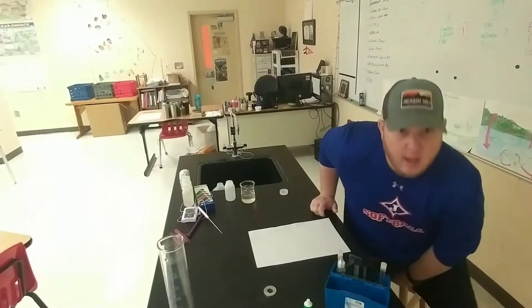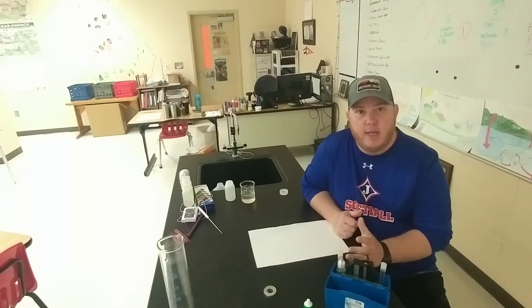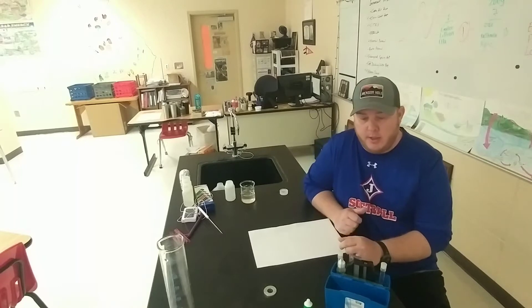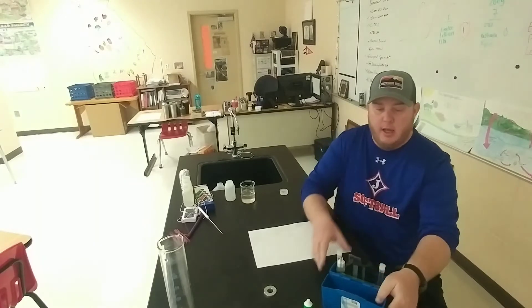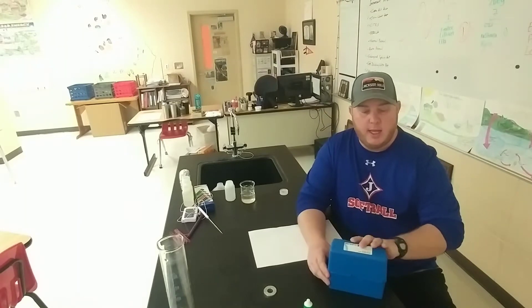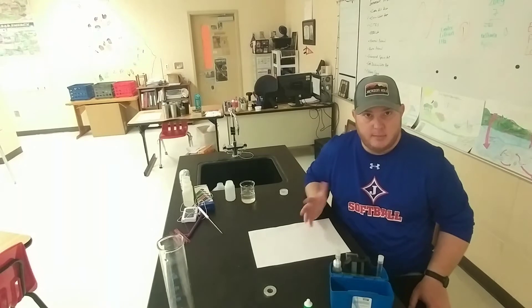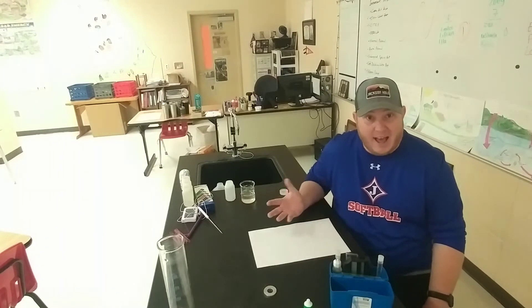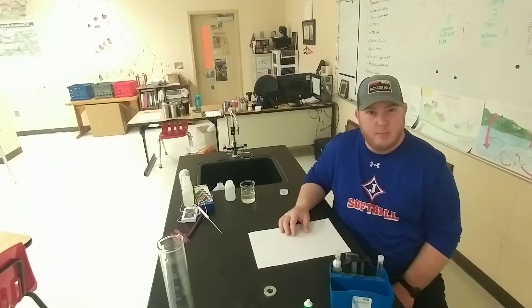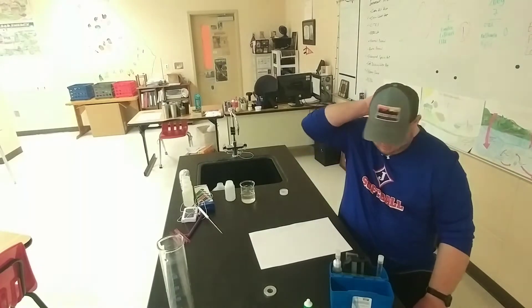We're in the lab here and the first thing we're going to do is check our pH. We did that in the field but we want to check it here in the lab just to make sure. I've got a pH testing kit that goes from a pH of 3 to 10.5. We're expecting it to be right around 7.5 or so — we got 7.36 from the field test.